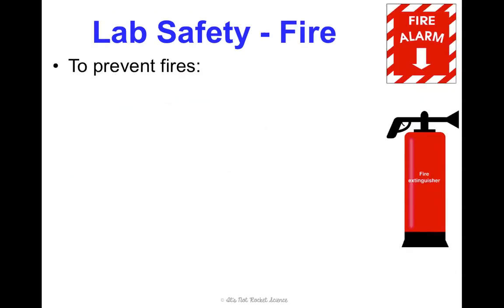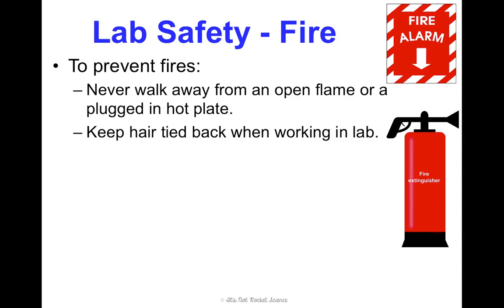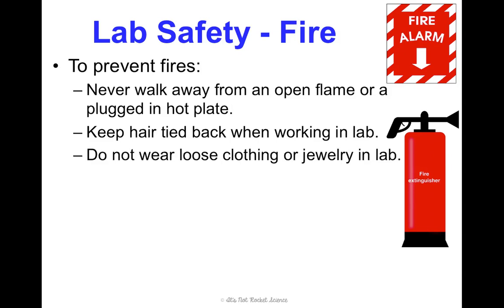In case of a fire, there are a couple of things we'll do first just to prevent fires. You'll never, ever walk away from an open flame or a hot plate — someone in your lab group needs to be there standing near it at all times. Also, keep your hair tied back when working in lab so you don't lean over and it gets caught in a flame. Same for loose clothing or long jewelry — you could lean over and your scarf or loose sweater could get caught in the flame and cause a fire.